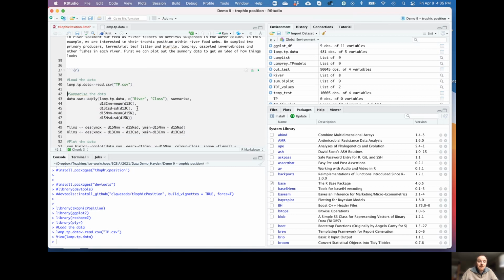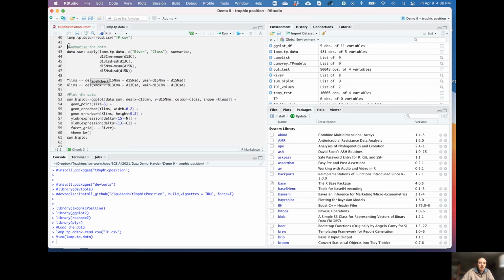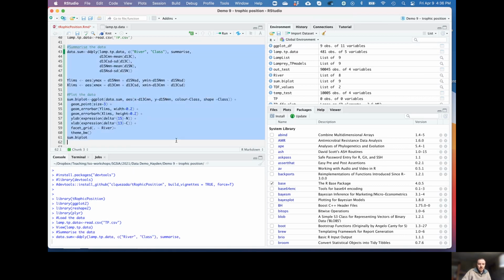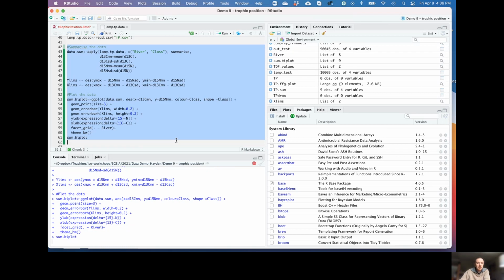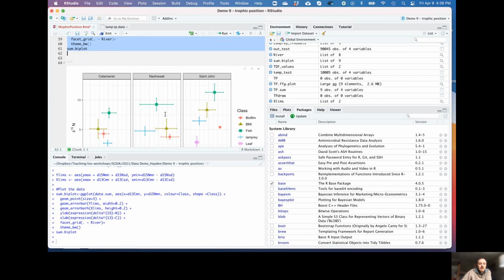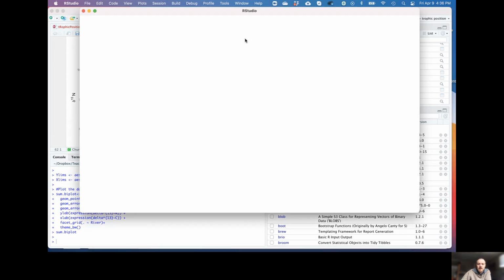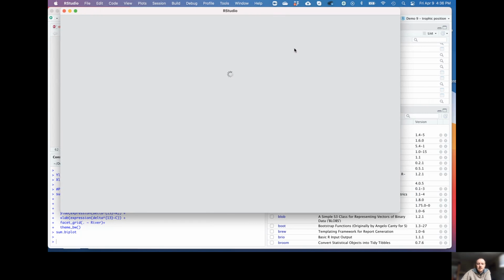So maybe we want to generate some summary stats and plot these out exactly as we've done before. New data set. Let's have a look, make some plots, get a handle on it before we start doing anything too intricate or too complicated. I'm not going to go through this in much detail, at least the mechanisms of this. We've done that in earlier lectures or videos. But we want to plug all the data in and create a summary biplot. And I'm going to blow this up, make it a bit bigger so it's a bit easier for you all to see.